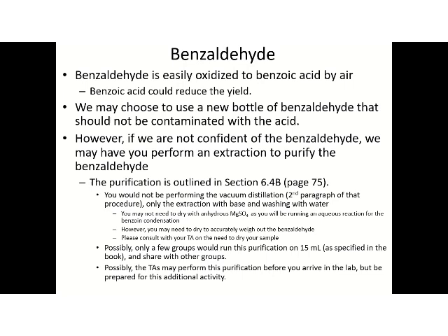If you weigh a wet starting material and then you get a pure product, the yield, according to your calculation, is going to be lower than the actual yield, and it's going to affect your results and the explanation of your results, right?